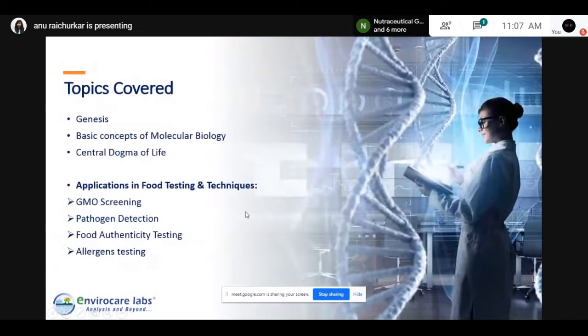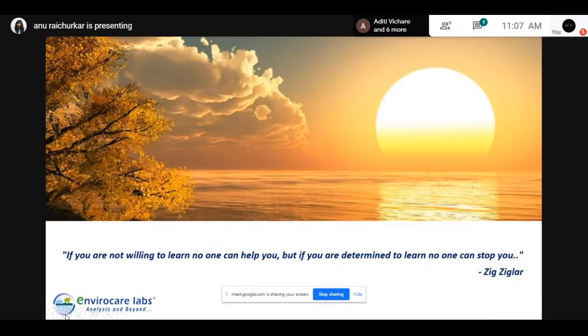The topics that I'll be covering start right from the beginning: how molecular biology was developed, what the basic concepts of molecular biology are, the central dogma of life, and the various applications in food testing. These include detailed techniques such as GMO screening, pathogen detection, food authenticity testing, and allergen testing.